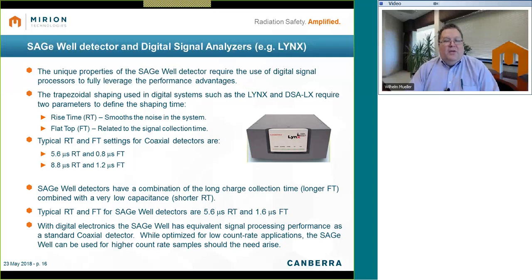There are two parameters that are needed to set that shaping time when using these systems. One is the rise time, and the rise time is really related to the noise of the system. So a lower noise system will require shorter rise times than a higher noise system.